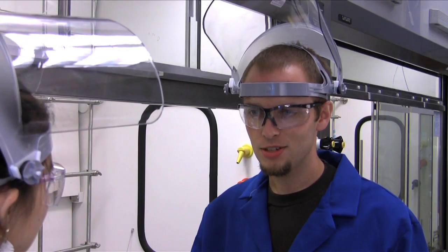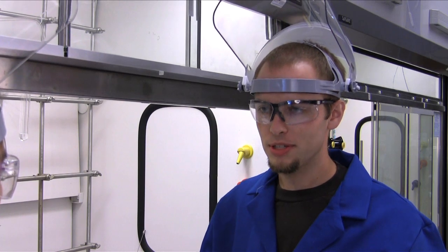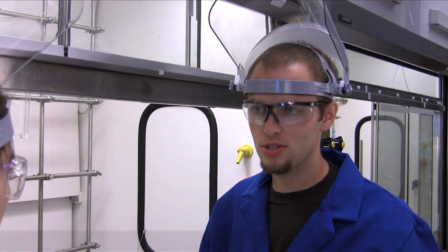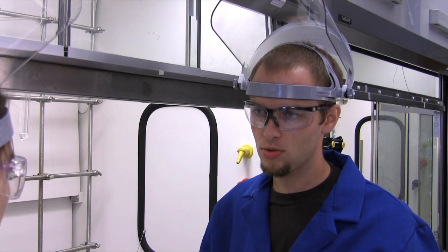Yep, and the last thing to do? Warn other lab mates that I'm working with a pyrophoric reagent. Absolutely. You never run these reactions alone, and it's safer if you have someone at your back with a fire extinguisher at the ready, just in case something goes wrong.